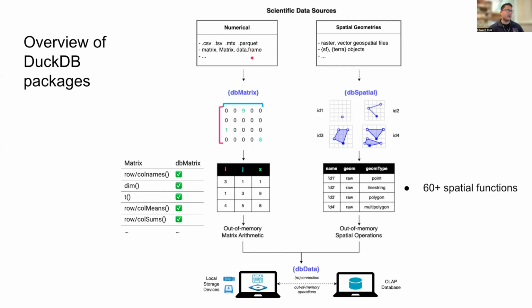We also want to be able to work with in-memory representations of matrices that we are already familiar with through the Matrix, capital M, and data frame packages.